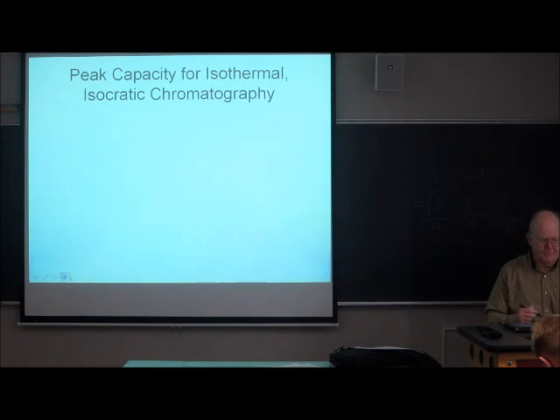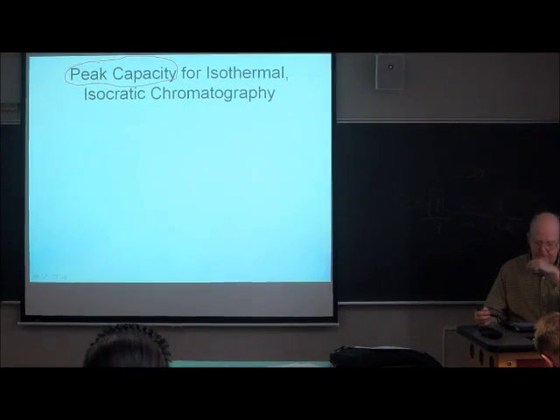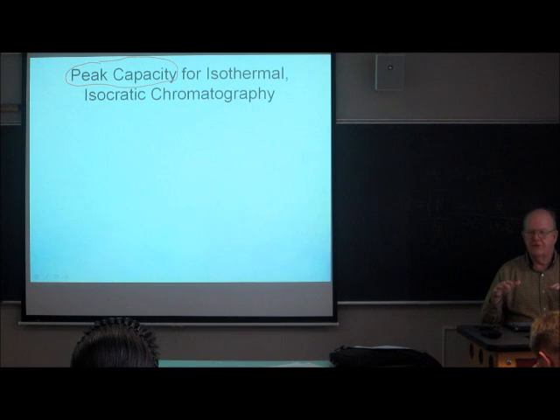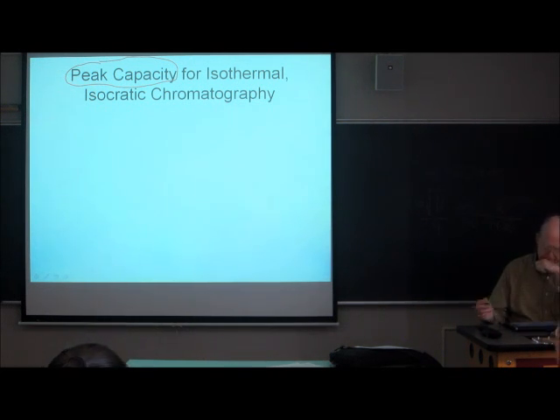Okay, let's change gears now and get into another somewhat advanced topic, which is the peak capacity. Let's initially consider the situation without changing the conditions during the run, because that introduces complications that we don't want to think about at the beginning.